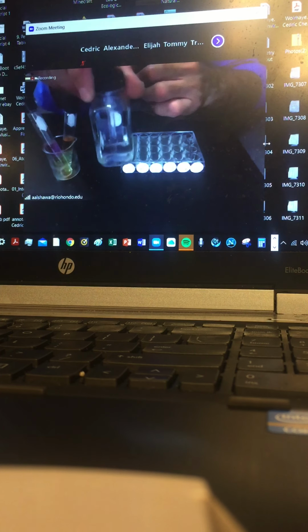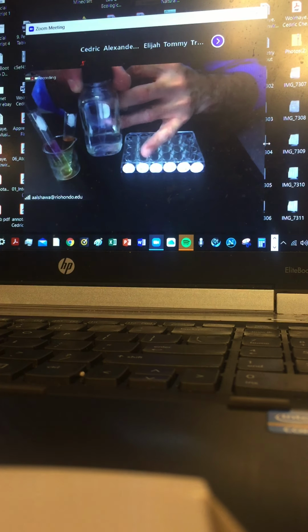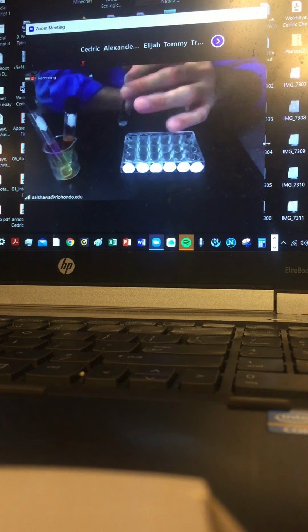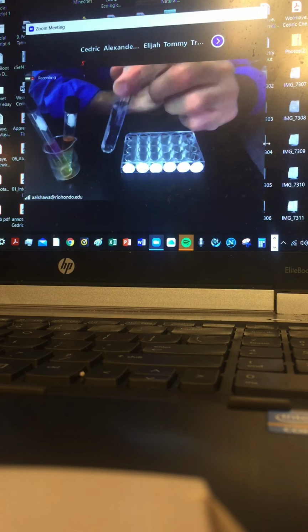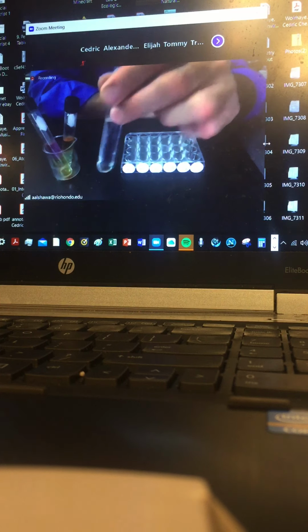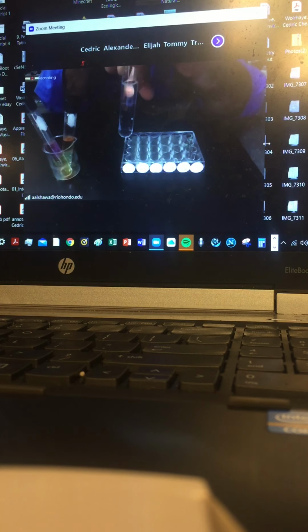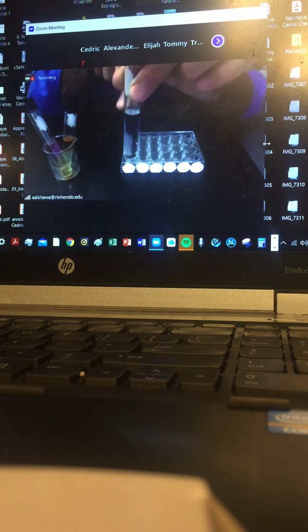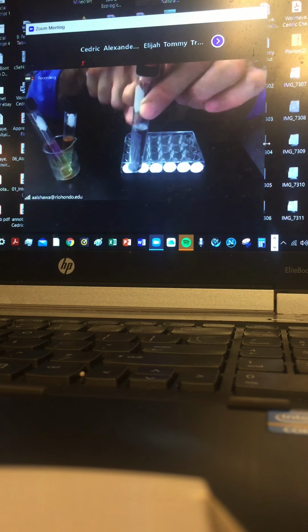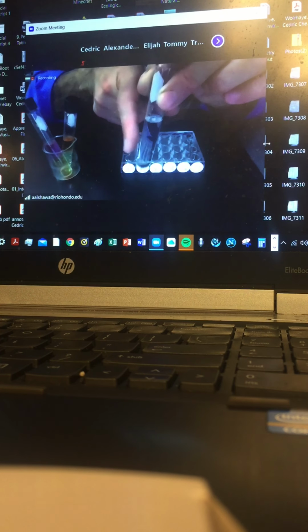So if that hint of yellow is gone, it means you no longer have any diatomic chlorine, any halogen, any Cl2. It all escaped. If you have a small amount of that chlorine with some organic layer, hexane, the mixture is the following. Hexane is lighter, less dense. So the layer on top is going to give us the environment where the chlorine, Cl2, the organic molecule, would love to be in. So Cl2 prefers and favors the organic environment, hexane, and doesn't like to be inside the aqueous solution.